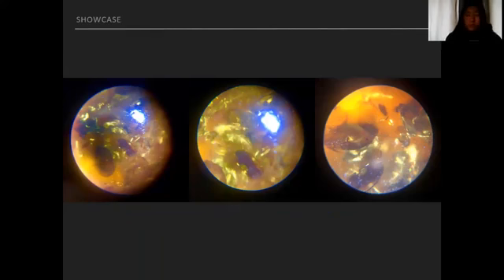So this is my masterpiece, or I should say the masterpieces. This is actually 3 pictures that I put together. Take a guess. Oh, by the way, if you guess that these 3 pictures are some weird planets outside Earth, good guess, but this is a microscopy class. But I'm sure you can find your spot in our astrophysics program. Let's reveal it now.